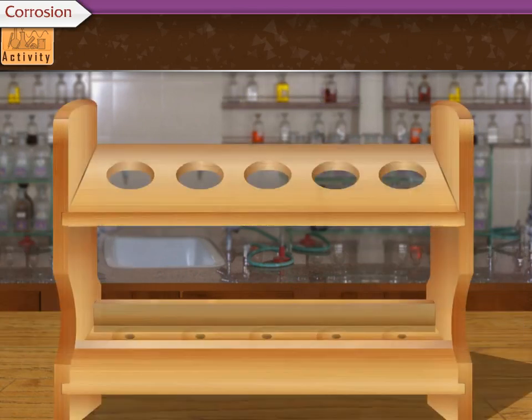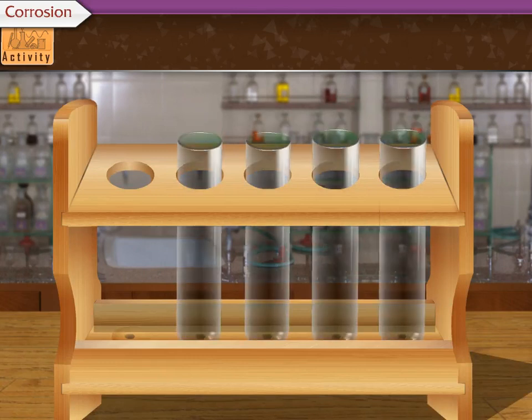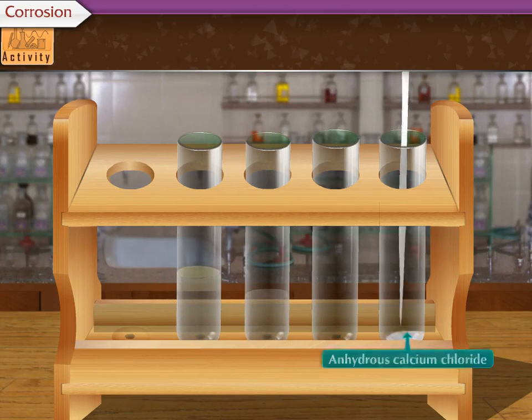Let us begin with the activity. First, let us take 4 test tubes. Take some boiled water in one test tube and put an oil layer on it. Take some salt water in the second test tube. Let there be only air in the third test tube. In the fourth test tube, take some anhydrous calcium chloride.